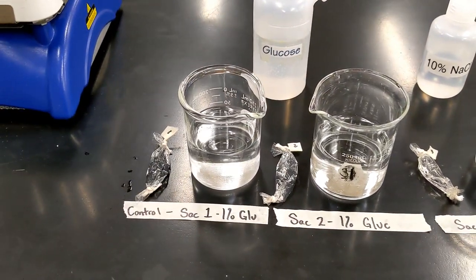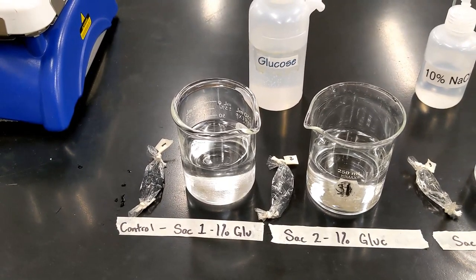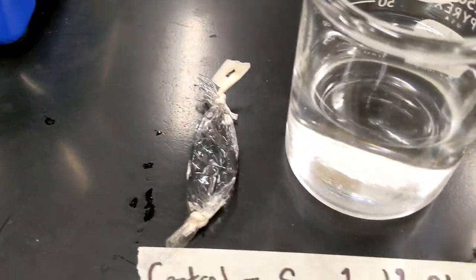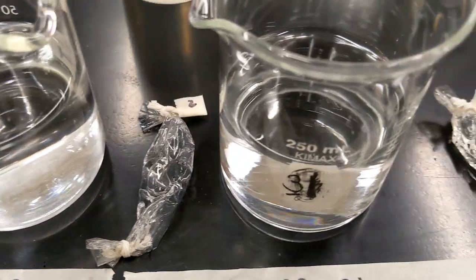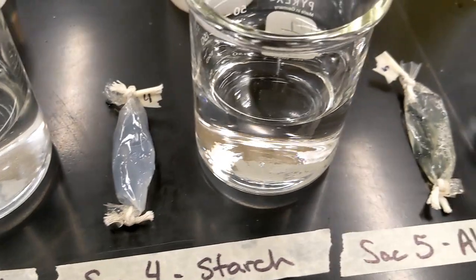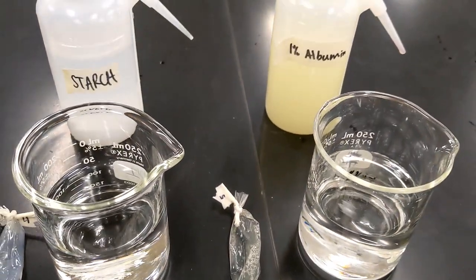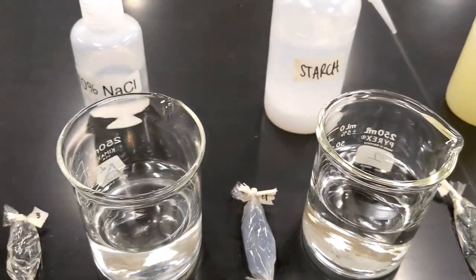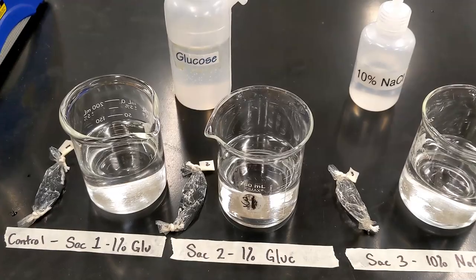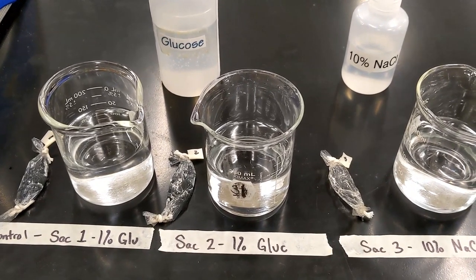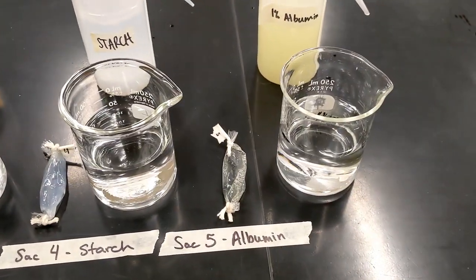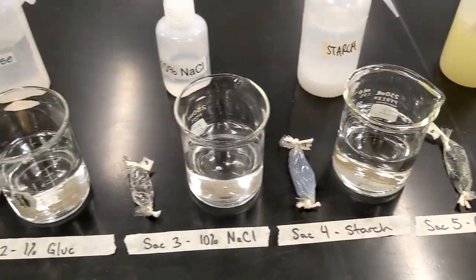We also have five different dialysis bags or sacks, and each of these dialysis bags contains a specific solution as well. If you look through your lab handout, you will see beaker one contains one percent glucose, beaker two contains distilled water, and beakers three, four, and five also contain distilled water.